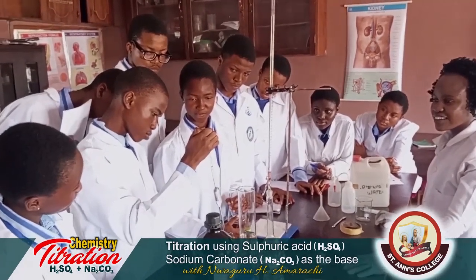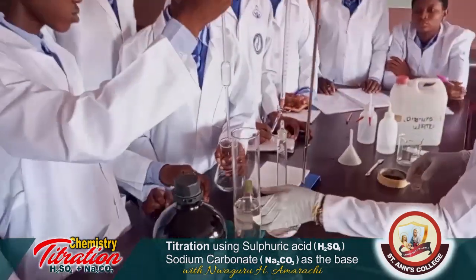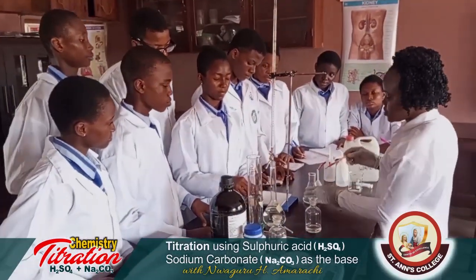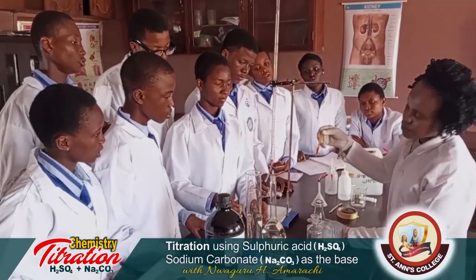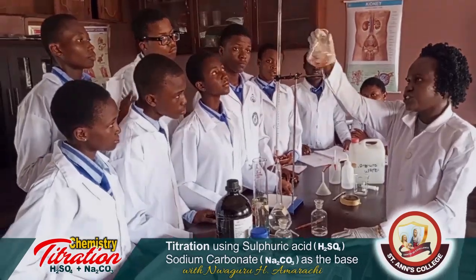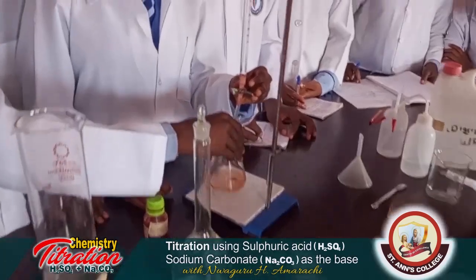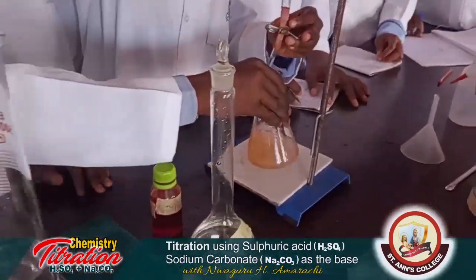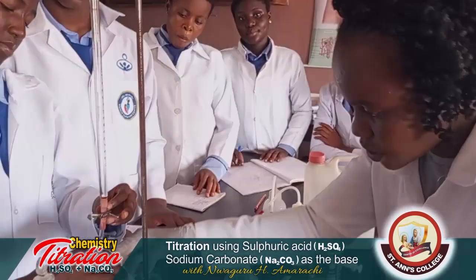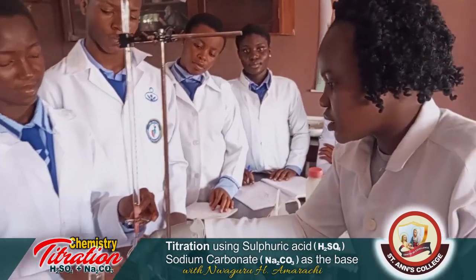Easy, easy. That's for the second titration, right? Remember our indicator: two drops. Good. You can view the color change. Then let's titrate. You can also view it to know whether there is a reaction or a change. See, you're getting a slight change.